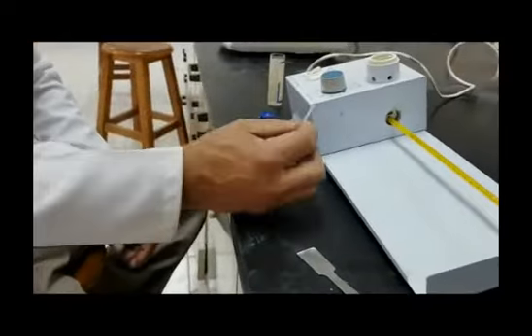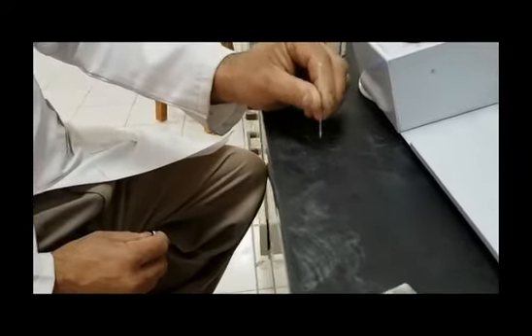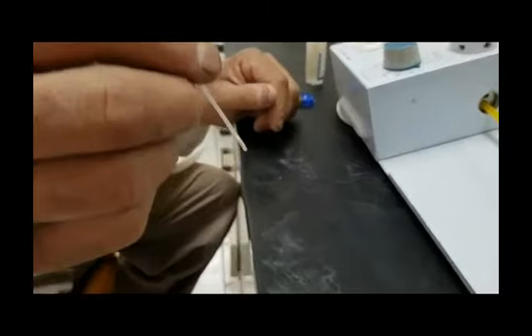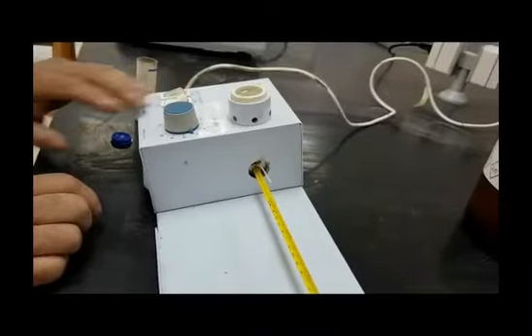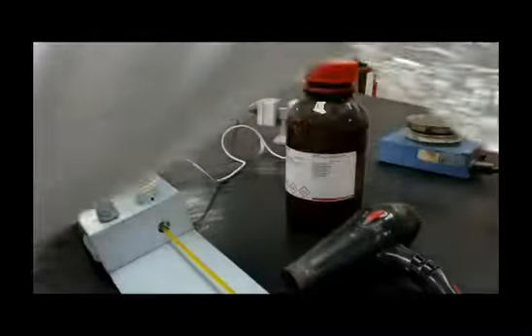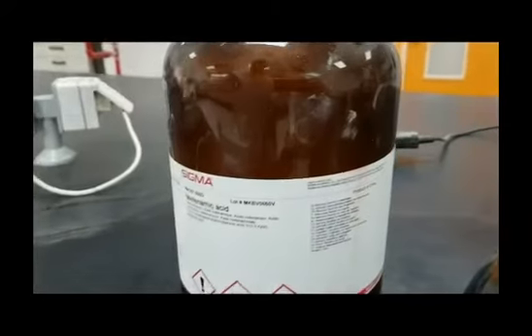Again, to confirm the formation of the salt, we have to measure the melting point of the prepared salt and the melting point of mefenamic acid, the raw material. What will confirm the formation of the salt is if we end up with two different melting points. Then confirmation by the generation of two different melting point ranges.